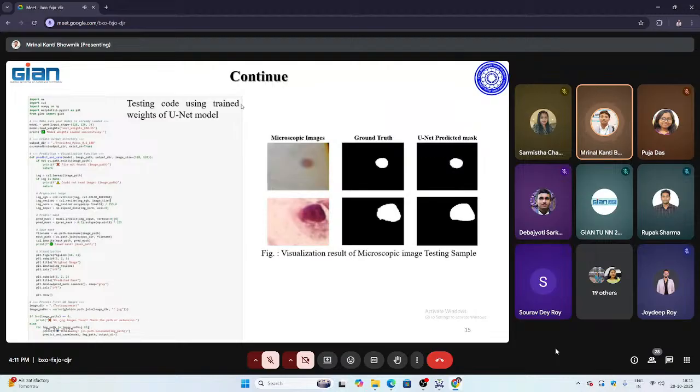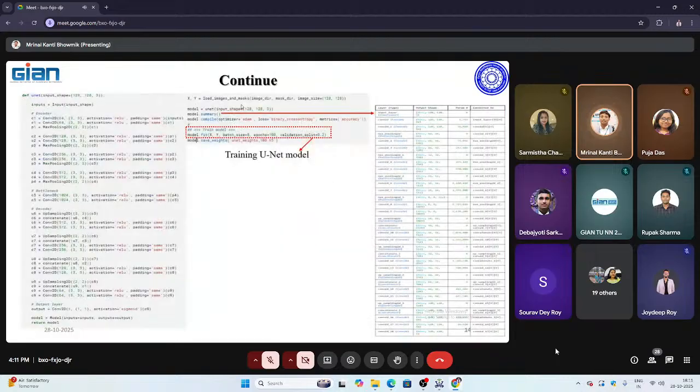I have considered the testing operation, because previously the training has been done. Means for 100 epochs the model has been made to learn where in the image the nucleus is present, through ground truth.